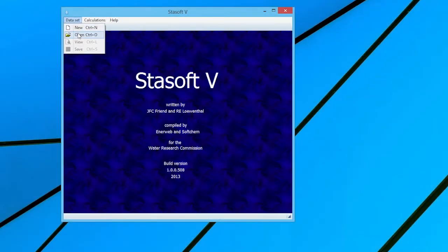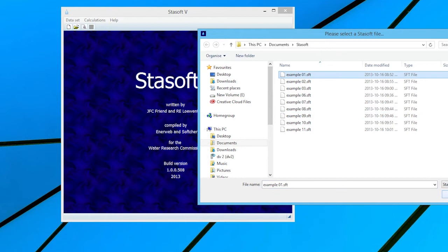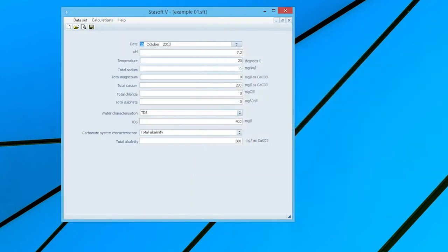When selecting the Open option, the File Name Input window will appear. Once a file is loaded, the data of the relevant file will appear within the Data Set Input window. All the data within this window, whether new or from a previously saved file, can be edited within this window.